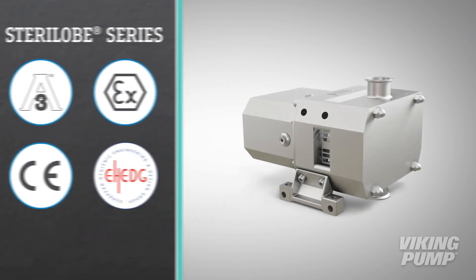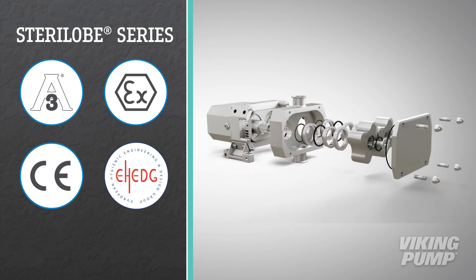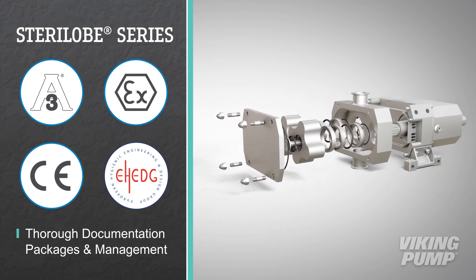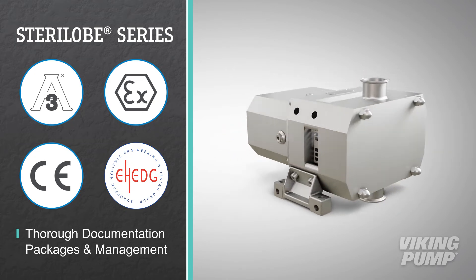This series carries 3A, ATEX, CE, and EHEDG certifications, making it compliant in almost any application. With thorough documentation packages and rigorous document management, you can have confidence that all required pump data is readily available.